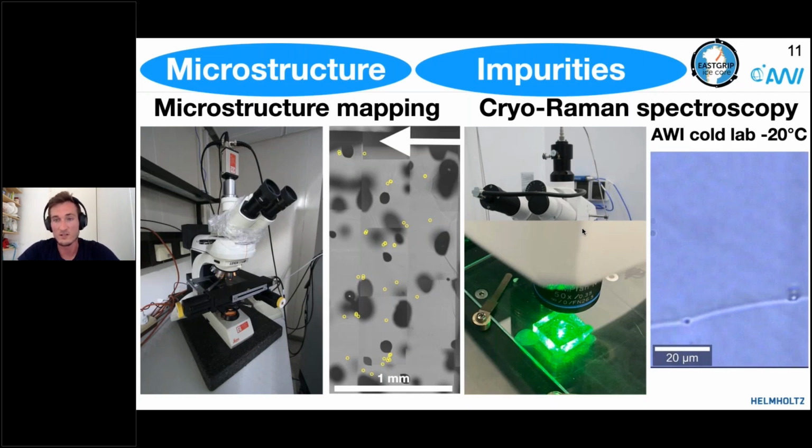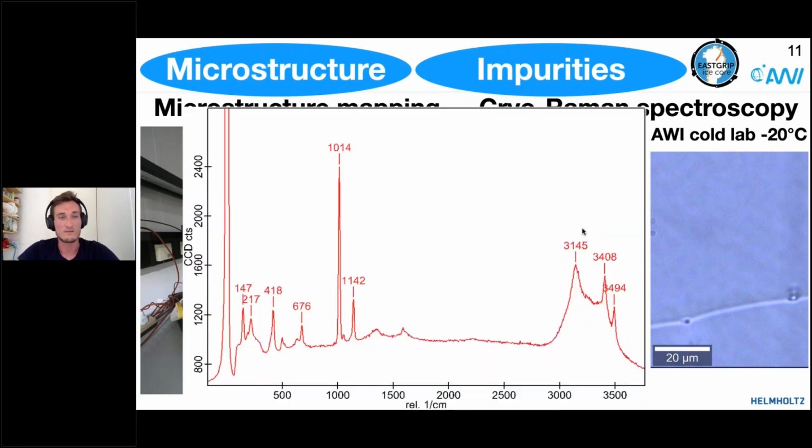So those are those little inclusions we're looking for. They are really just a couple of micrometers, normally even smaller than that. And then you get a signal, your Raman measurements. So Raman measurements, basically you shoot with a laser at your inclusions and the molecule starts to vibrate and you get a little bit of Raman scattering.